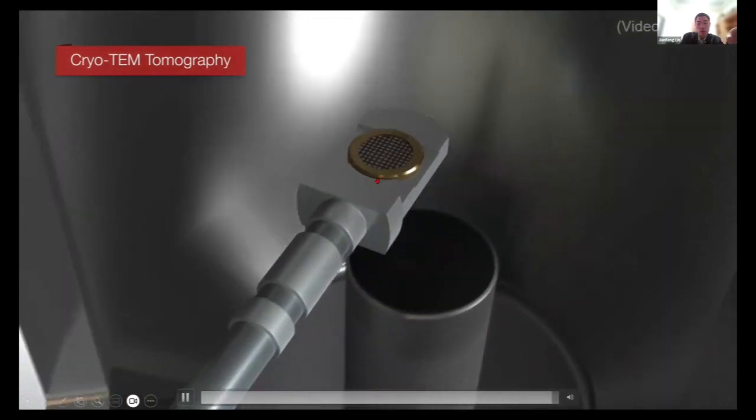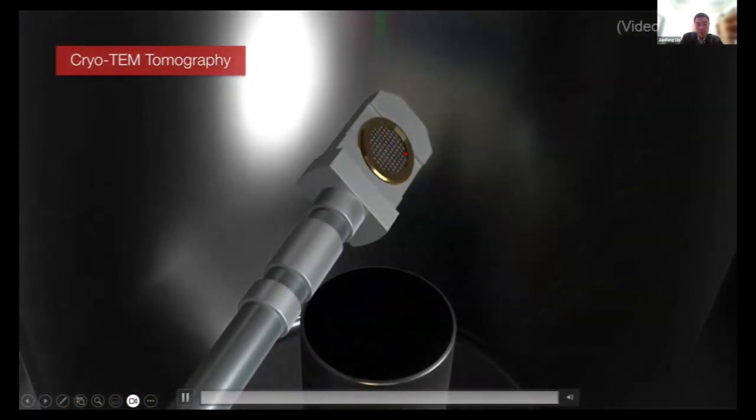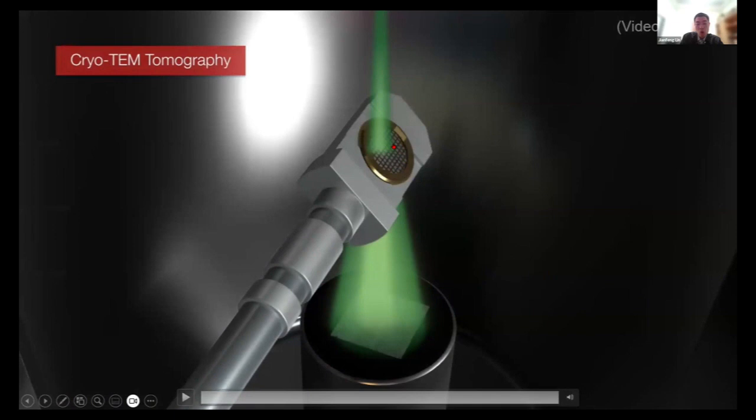And after that, you also do platinum sputtering to increase the conductivity, and then you transfer the sample into the transmission electron microscope holder, and tilt the sample to acquire tilt series images for cryo-electron tomography work, or just do in situ work, which was introduced this morning by Professor Yang.